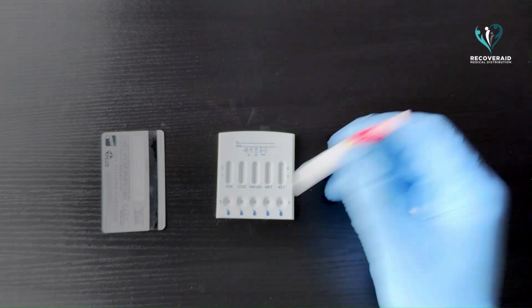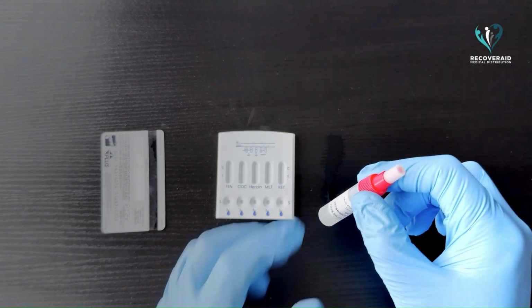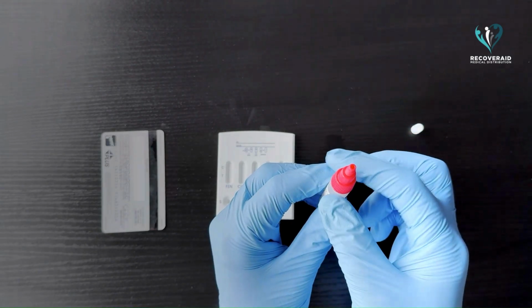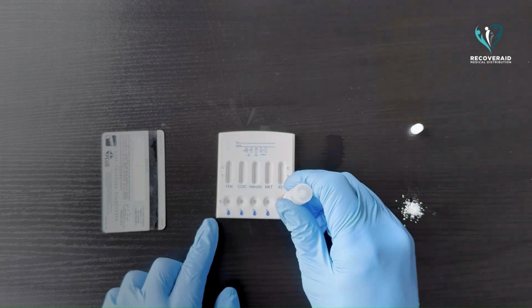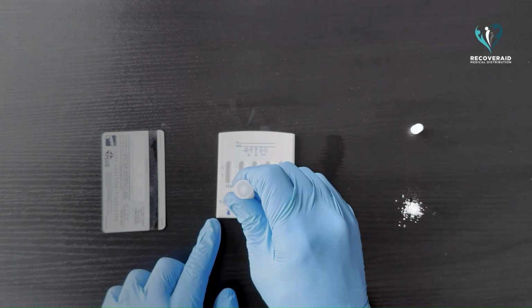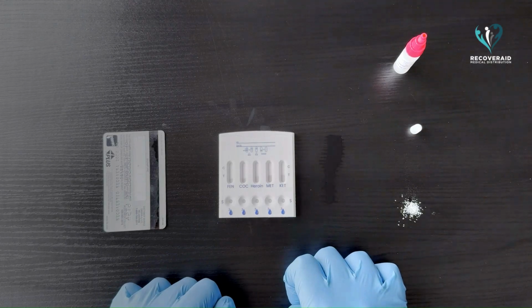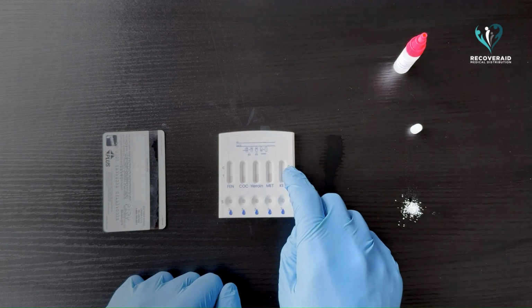Shake the bottle 10 to 15 times to thoroughly mix the sample with the buffer solution. Next, unscrew the dispensing cap and add 3 drops into each sample well on the cassette. Once the sample has been added, you'll see the liquid migrate up each test window of the test strip.